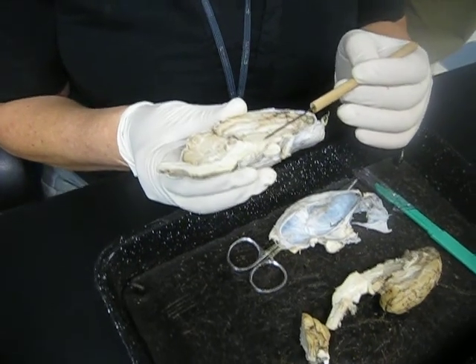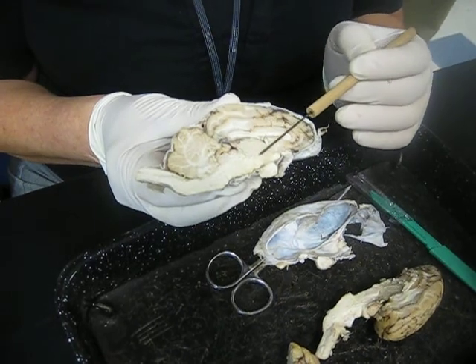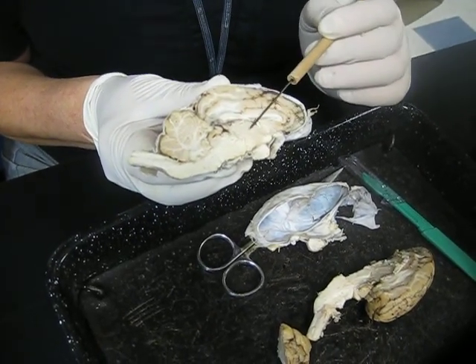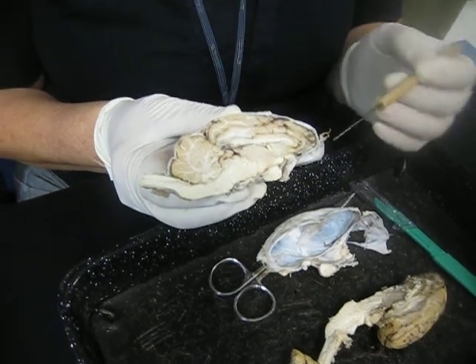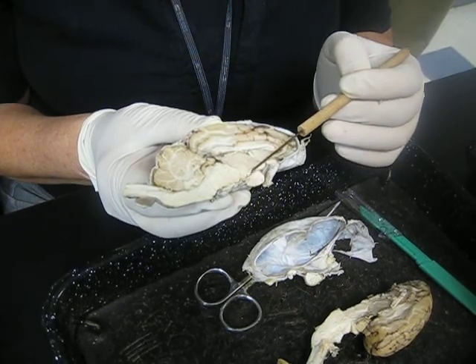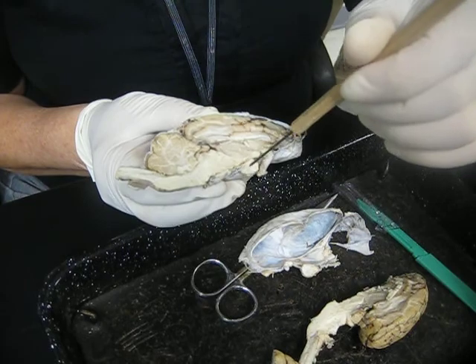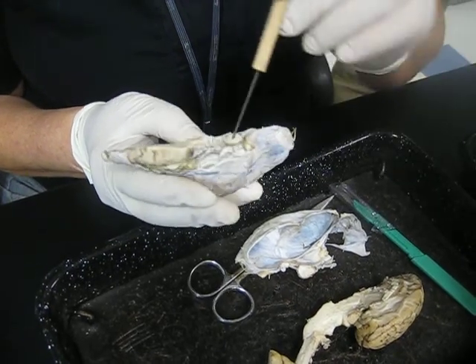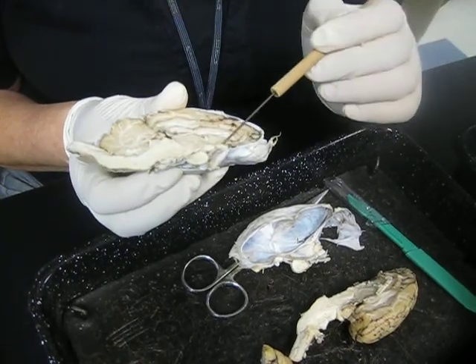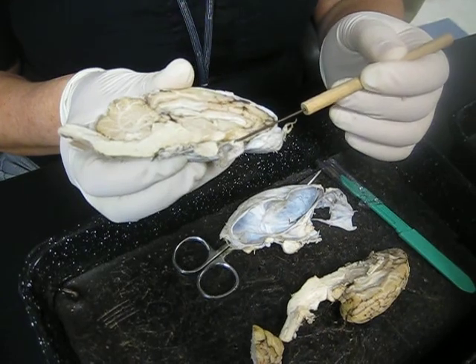Below the corpus callosum, you see this dark mass right here. That's the thalamus. The thalamus, in the very middle, you kind of see that little line, that indent. That's the intermediate mass of the thalamus. Below the thalamus is the hypothalamus. This is the hypothalamus. Below the hypothalamus is the pituitary gland. So if you put it like this, you would see that that's the pituitary gland. This right here is a piece of the section of the optic chiasma.